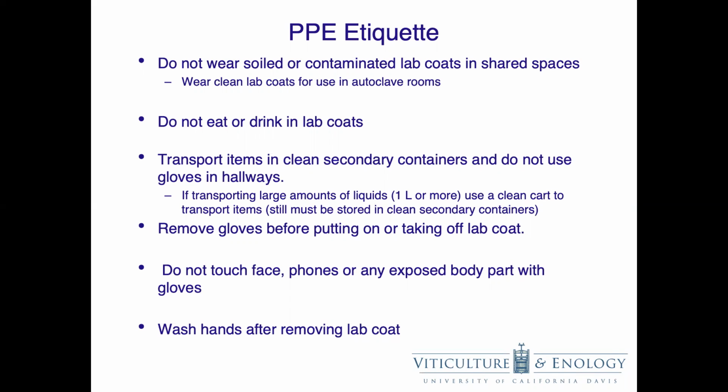Remove gloves before putting on or taking off lab coats. I've seen people touch biohazardous materials or chemicals with gloves, then remember they need a lab coat, and then put the lab coat on with those same gloves on. Doing this contaminates the inside of your lab coat and therefore any part of you touching the lab coat. Do not touch your face, phone, headphones, or any exposed body part with gloves. Doing so can contaminate your skin or personal items with any of the hazards that you have on your gloves.